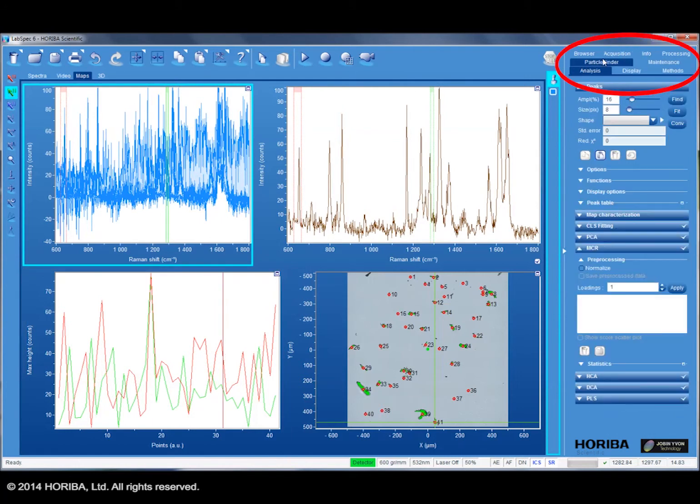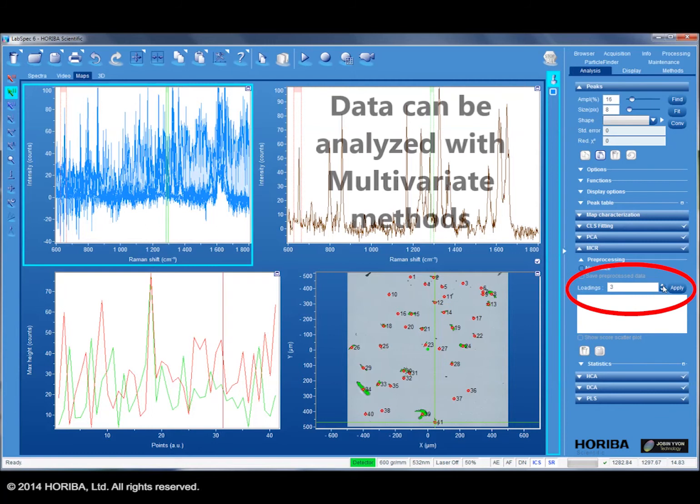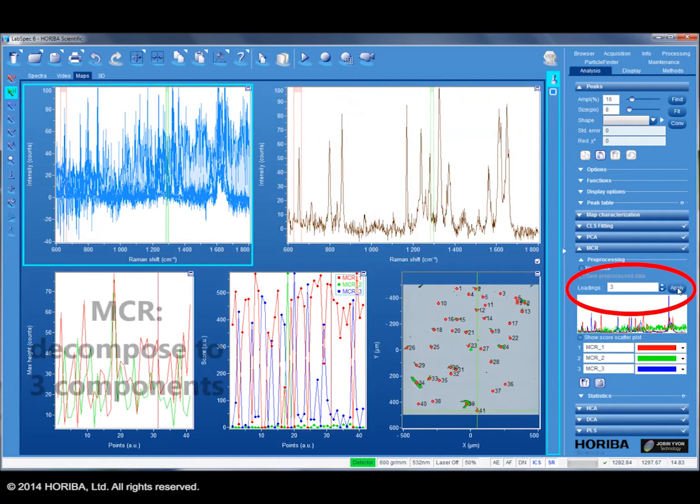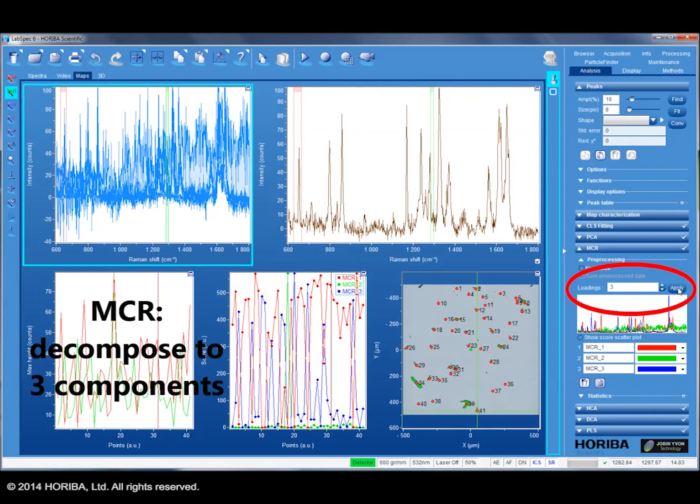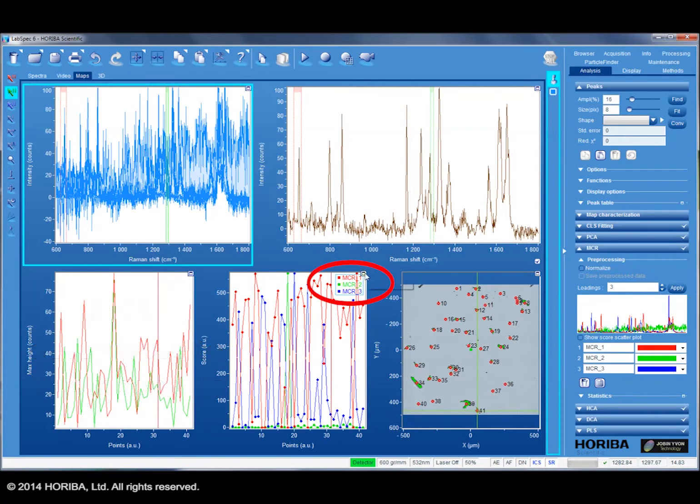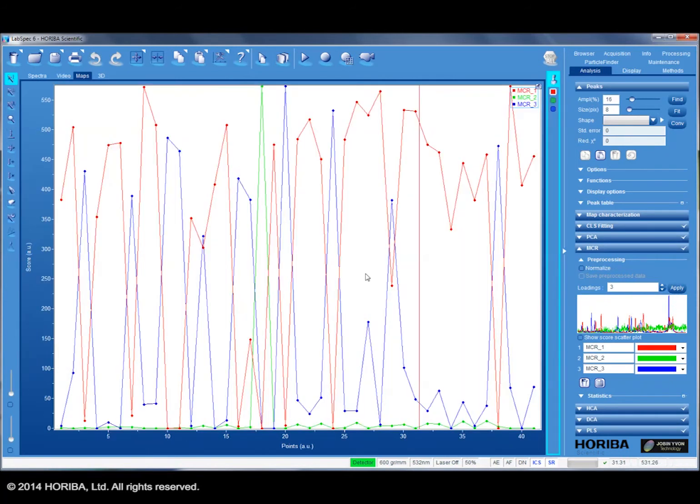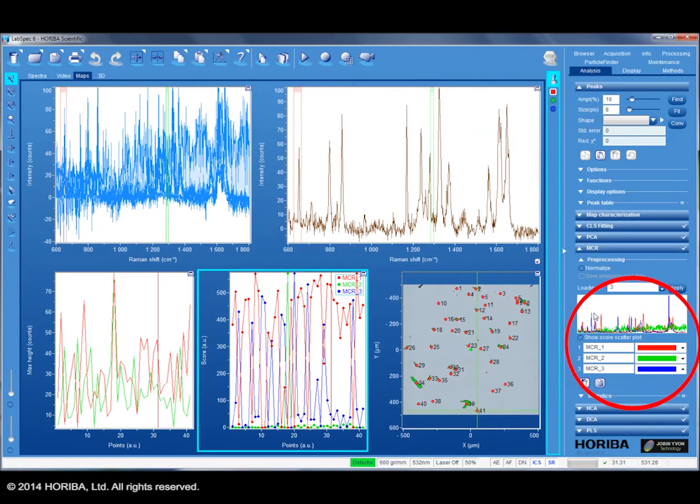For more detailed analysis, LabSpec's multivariate analysis module is available. In this case, multivariate curve resolution analysis can be used to decompose the dataset into three representative average spectra. Looking in detail, each particle is primarily composed of just one component, allowing excellent classification of the particles.